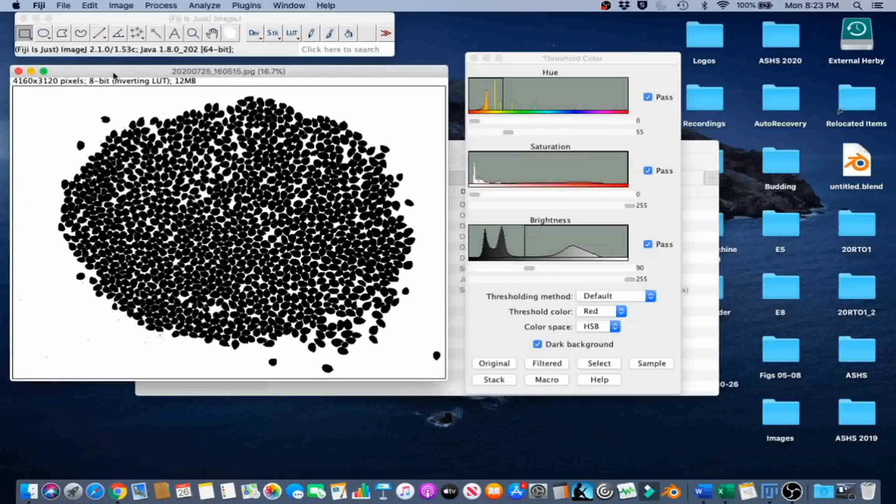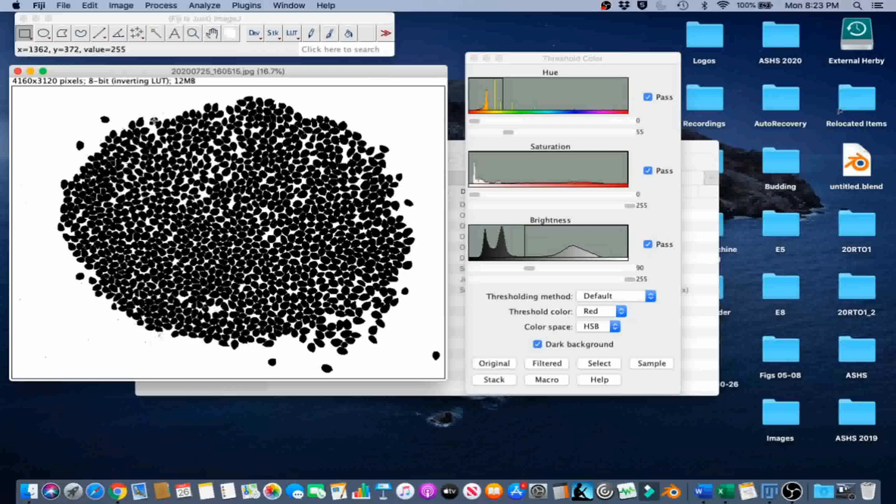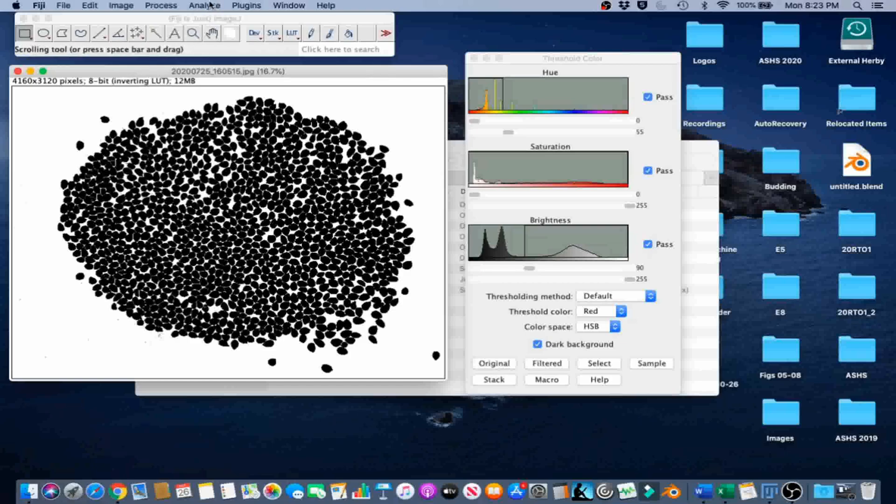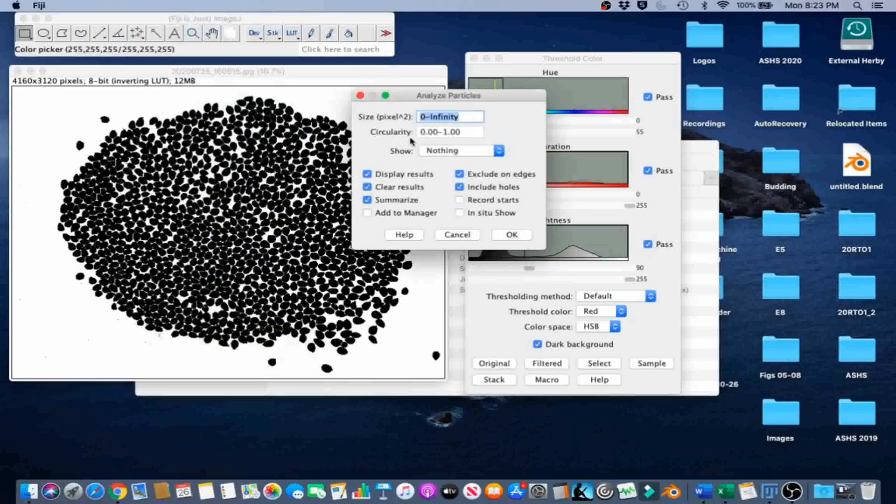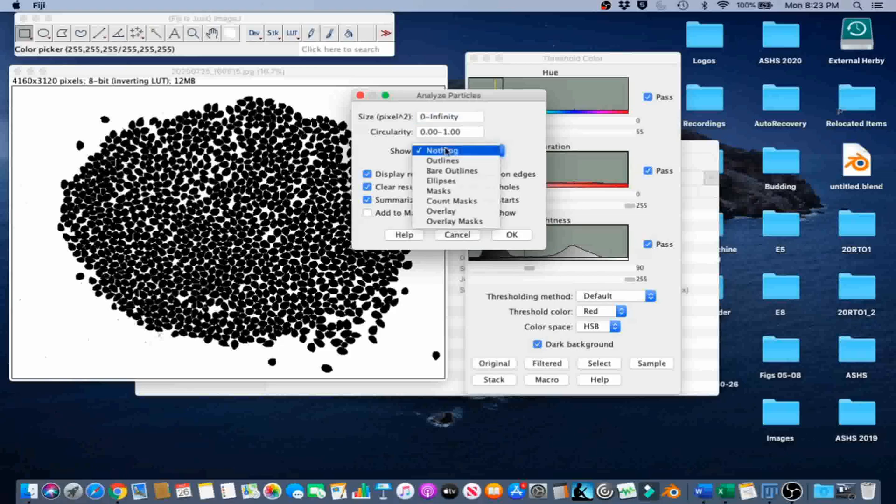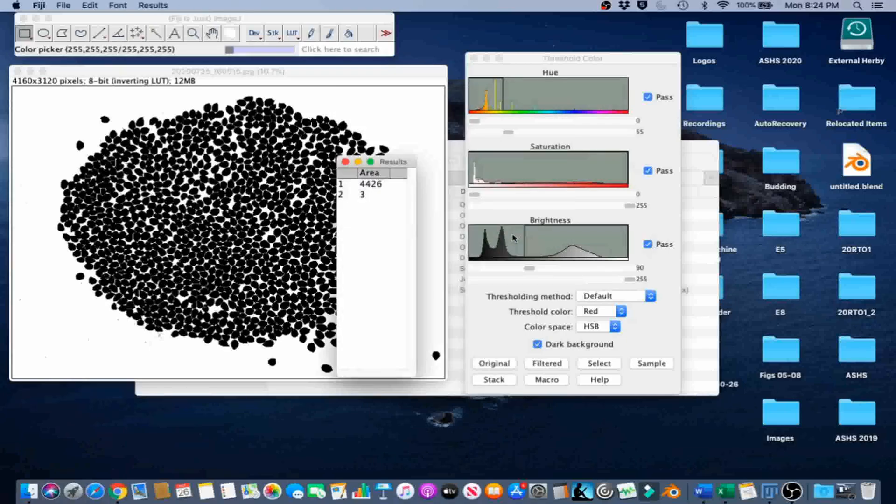Now we're going to count the seeds, but in order to do that, we need to figure out the minimum size for counting the pixel clusters. So we're going to do a scouting Analyze Particles. We're just going to include the total range for everything, with outlines for show so that we have numbered pixel clusters.